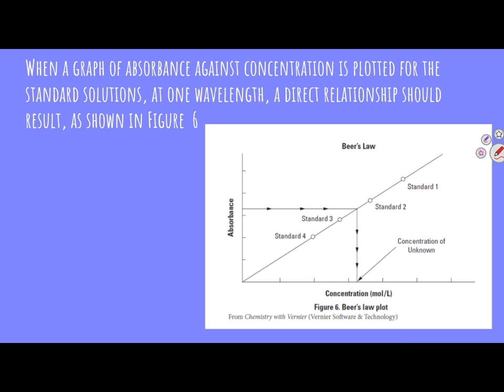All right, come back to me. Anybody got the value of a calibration curve? I need to know why we value calibration curves in chemistry. Okay, so we can find our linear relationship. In this particular lab, what are we going to find our linear relationship between? Absorption and concentration.